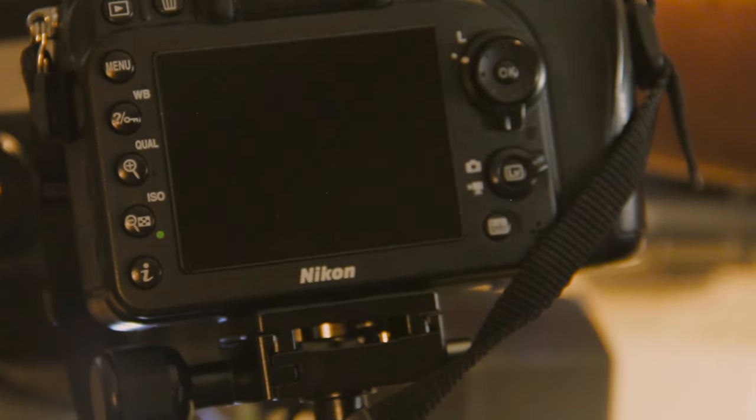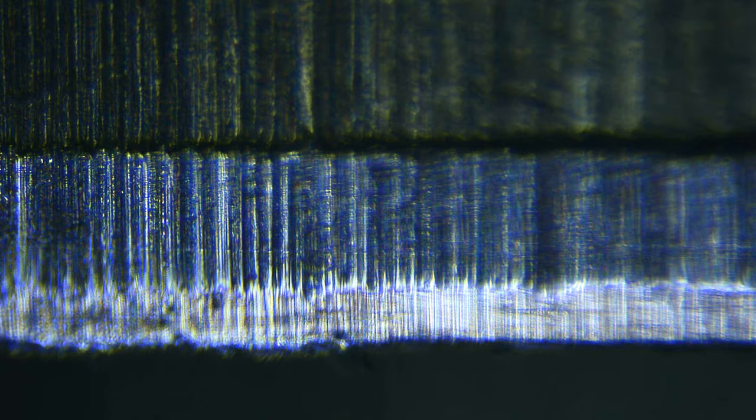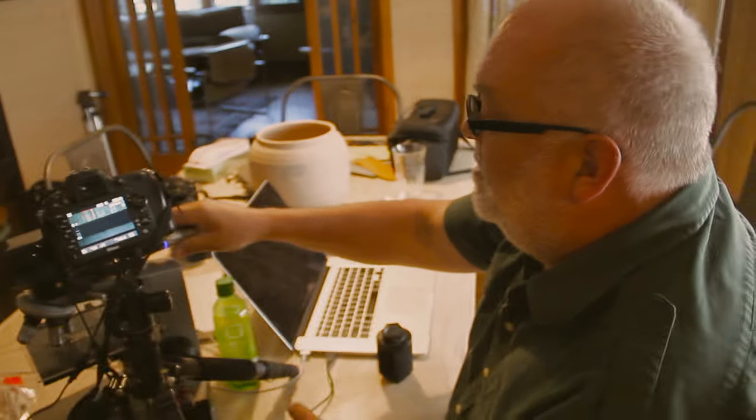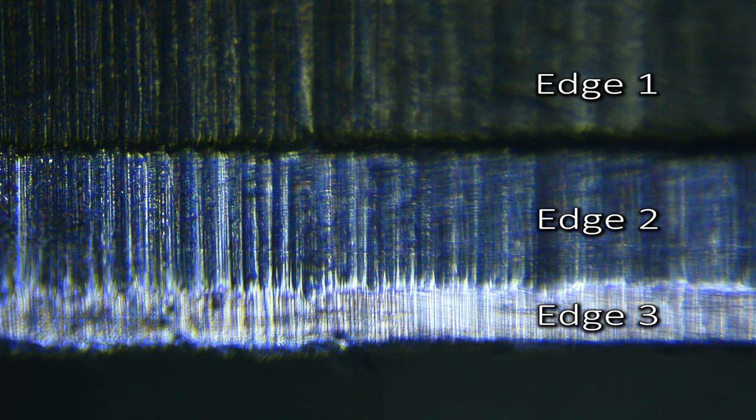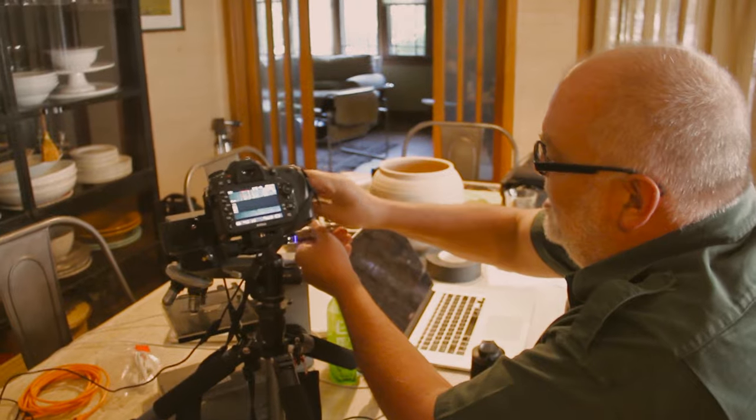Let's see if we can — oh, look at that. Oh, that's really cool. I can work with that. So there's like three edges to that. Yep. I never would have guessed. Well, that's why we have microscopes. That's why we use science.